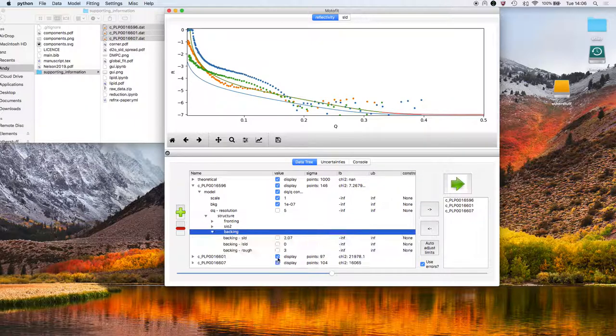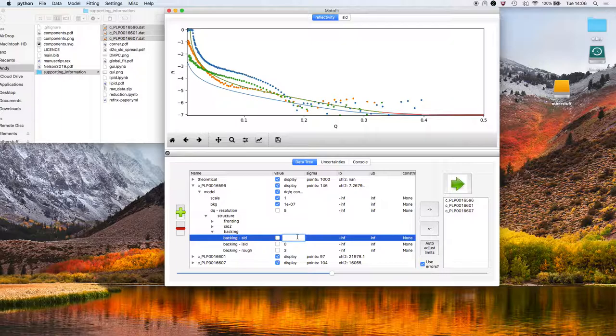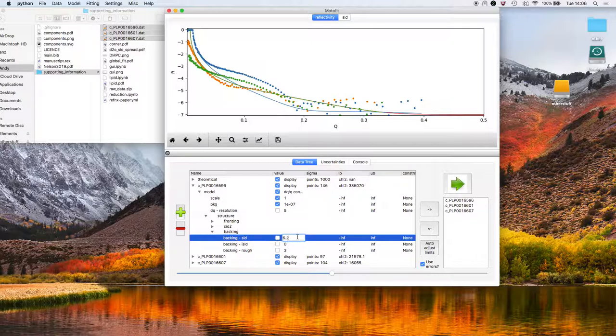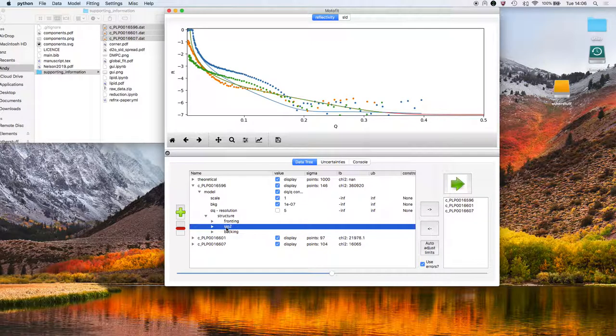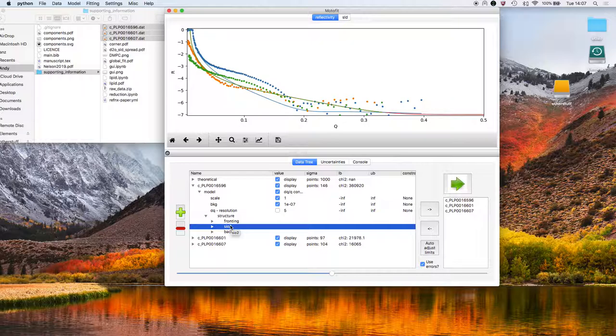Now we're going to the backing medium for this particular dataset, which is the D2O. I think it's about 6.2, not perfect D2O. Right. So we go from silicon to silicon dioxide. Next we're going to need to insert the bilayer now.